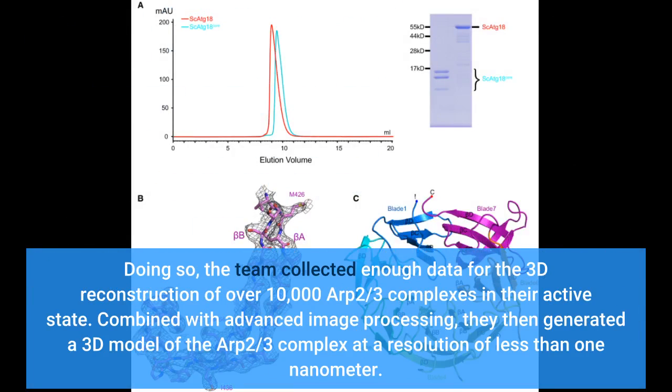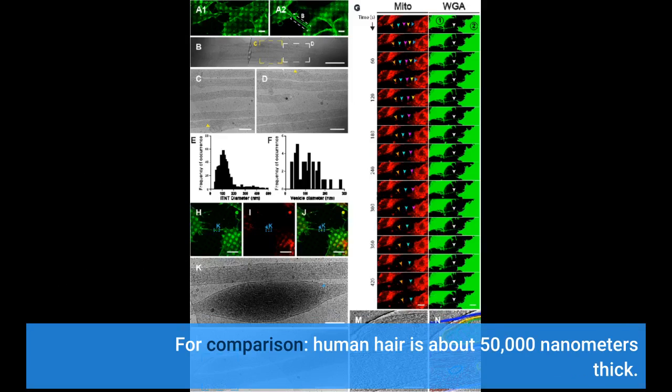Doing so, the team collected enough data for the 3D reconstruction of over 10,000 ARP 2/3 complexes in their active state. Combined with advanced image processing, they then generated a 3D model of the ARP 2/3 complex at a resolution of less than 1 nanometer. For comparison, human hair is about 50,000 nanometers thick.